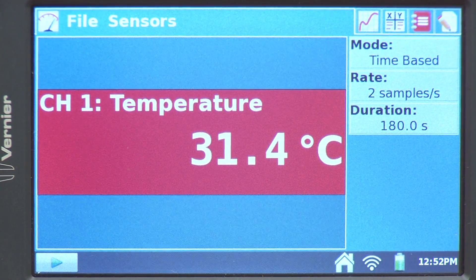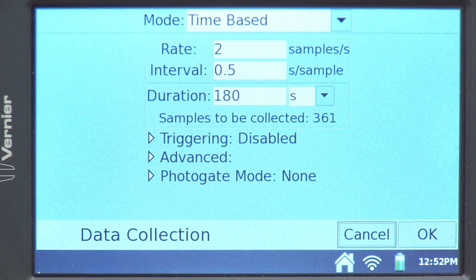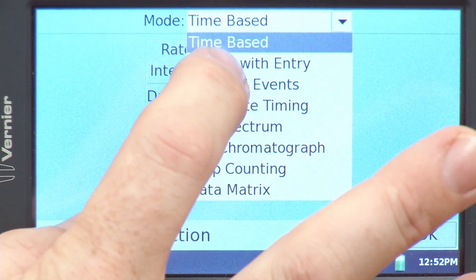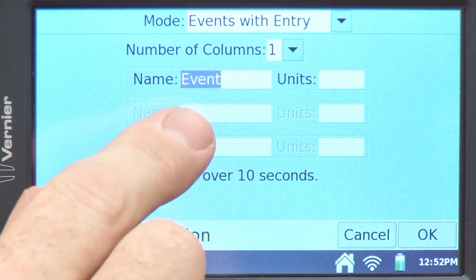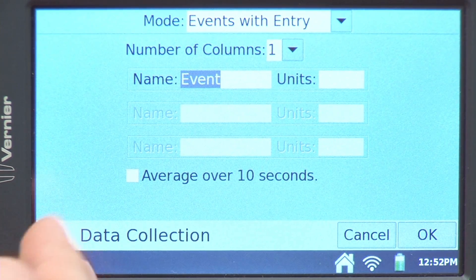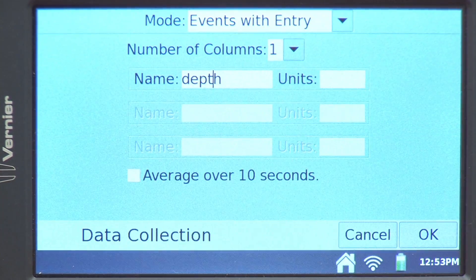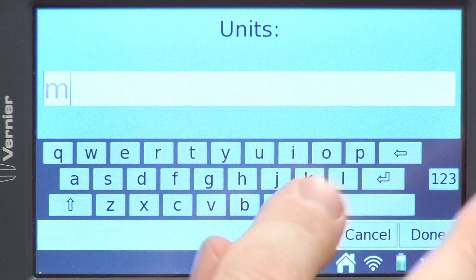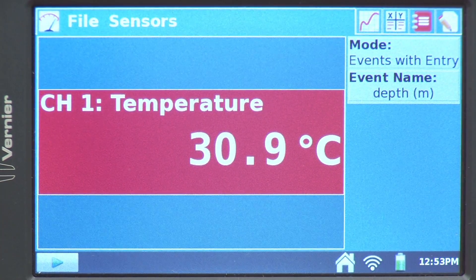Since we're doing a temperature profile of the pond, I want to change the mode from time-based to events with entry. Events with entry allows me to measure one variable with the sensor, and then manually enter in the corresponding value — in this case, it's going to be the depth of the sensor in the water. I'll name this variable 'depth' and set the units to meters.